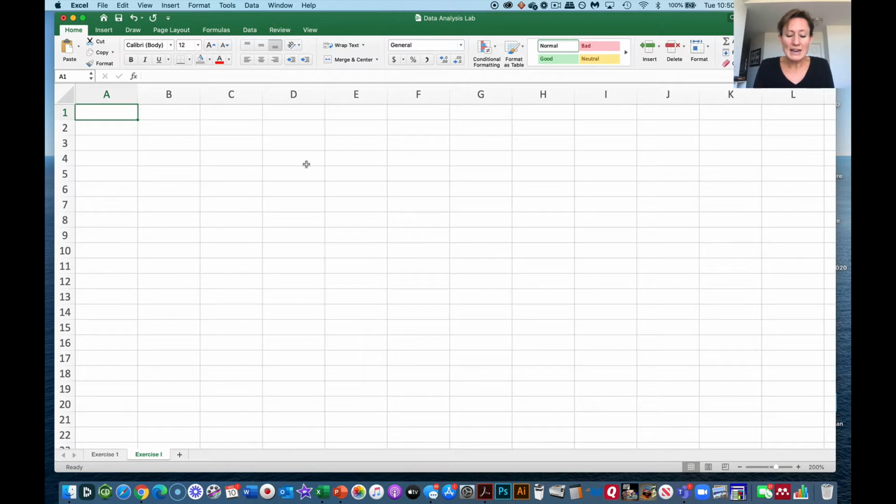So I'm going to have to create these tables that are here. This is all the information that's on your handout here. So we basically just need to type this information in. So we're going to have sample ID. We're going to have 10 samples. Stock volume. So we're always going to be taking 20 microliters of our stock volume.